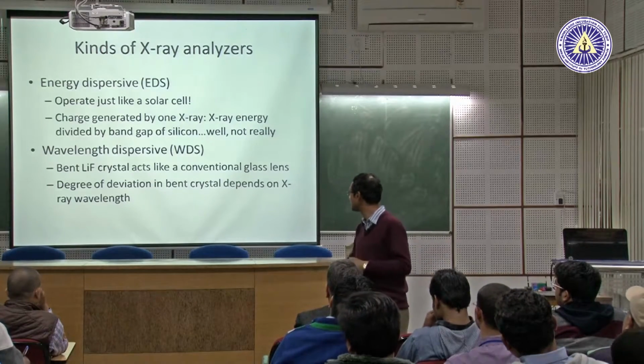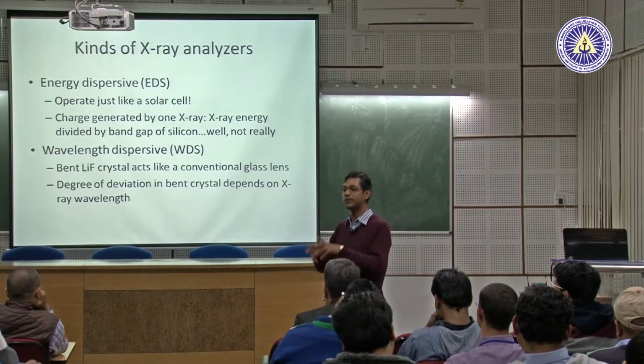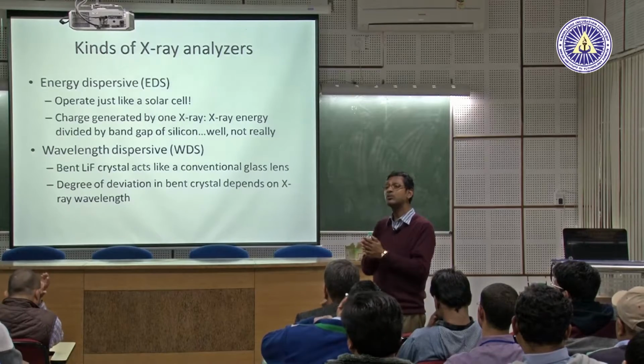Lithium fluoride is a crystal which is used for that. There are 4 different types of crystal I think that are used. I am not certain, but maybe more. So that is one thing.